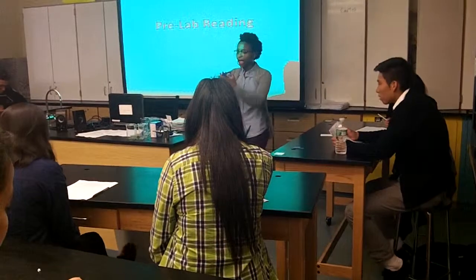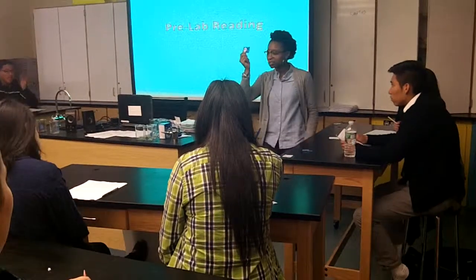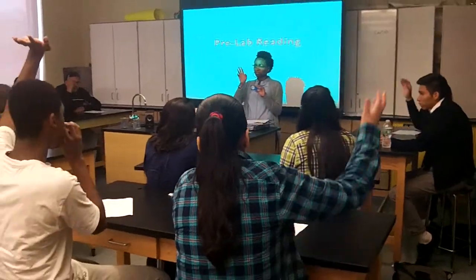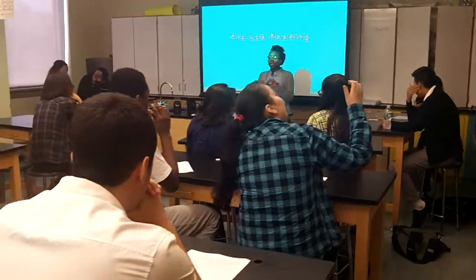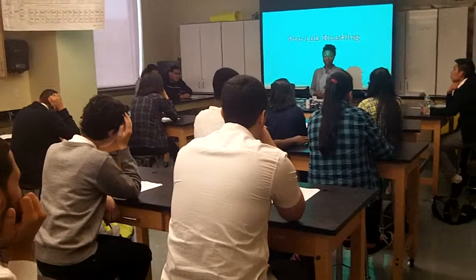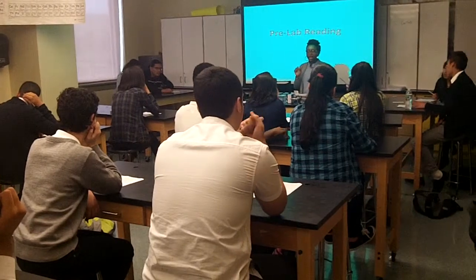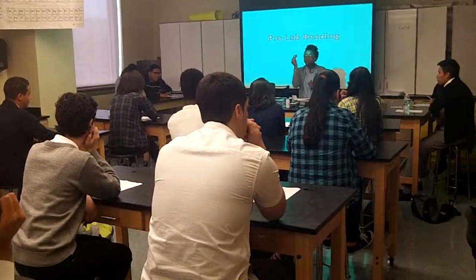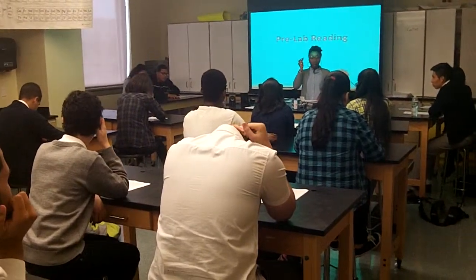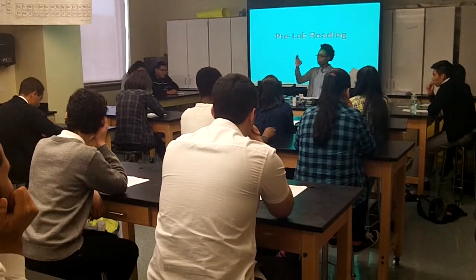All right. So today, you guys actually do get Alka-Seltzer. In one of my other labs, we had the off-brand stuff, but you guys get the best. So we have Alka-Seltzer. And how many of you are familiar with Alka-Seltzer? Have seen it or heard of it? Okay. So Alka-Seltzer is an antacid. That means when you put it into your stomach, it helps your upset stomach feel better. All right? And it's used for different things like sore muscles and various things. But today, we are going to be investigating the rate of this antacid tablet. But let's figure out the rate of this reaction. And we want to understand what is it reacting with and what does it really mean. So for our next paragraph, go ahead, Marco, and read for us.